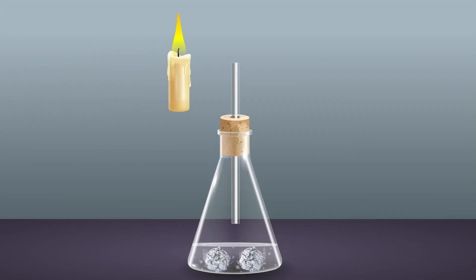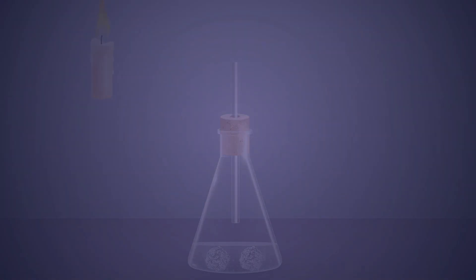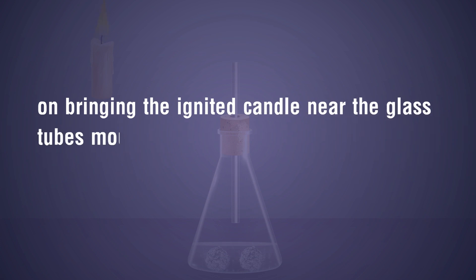Bring the lighted candle into the mouth of the glass tube. Observation: on bringing the ignited candle near the glass tube's mouth, the gas burns with a pop sound.